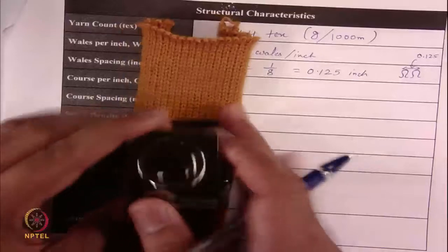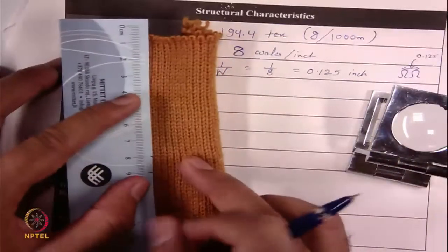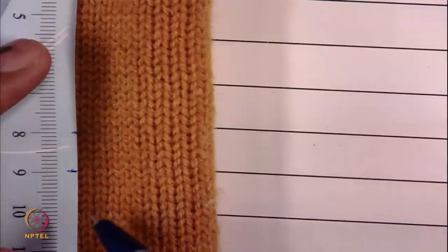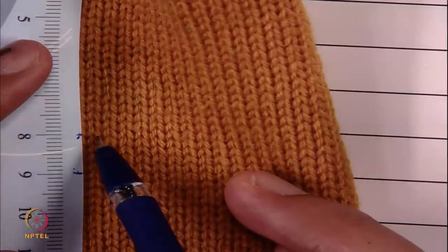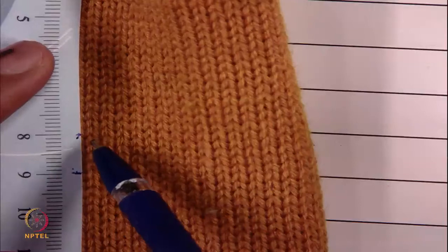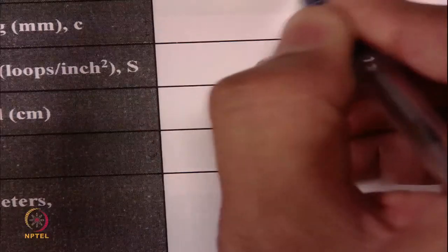Similarly, to find out the course per inch, you can put the pick glass and you can count. Or maybe from the scale also you can count how many courses. For example, in 1 centimeter length, how many courses you can count? 1, 2, 3, 4, 5, around 5, okay. 1, 2, 3, 4, 4 and a half, something like that. But if you use pick glass, you would be able to differentiate more easily because it gives you more enlarged view. So, right now the courses per inch is around 11 courses per inch.